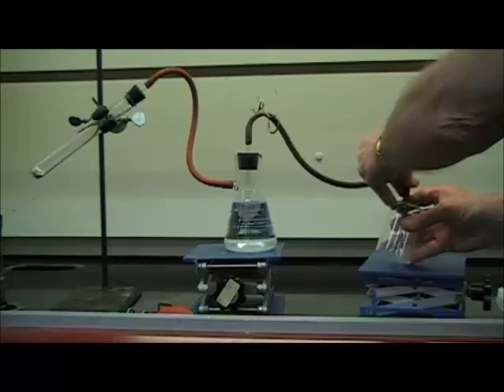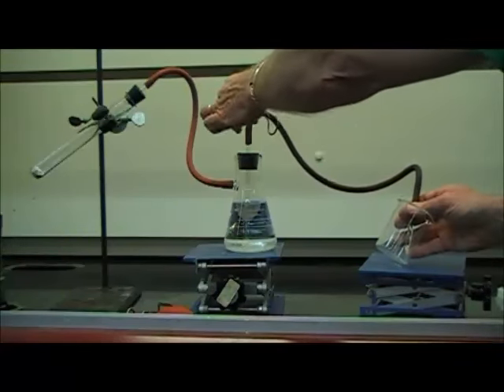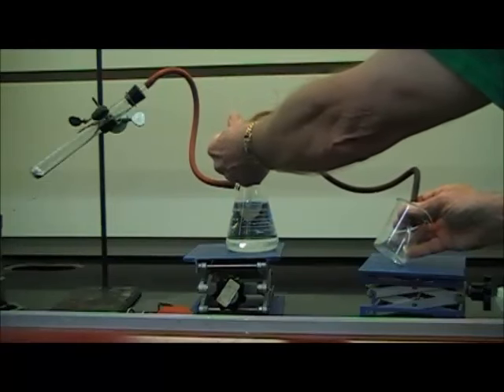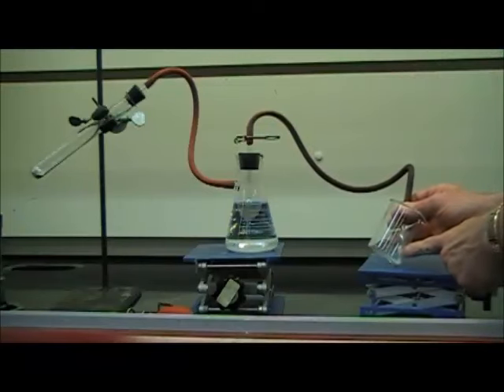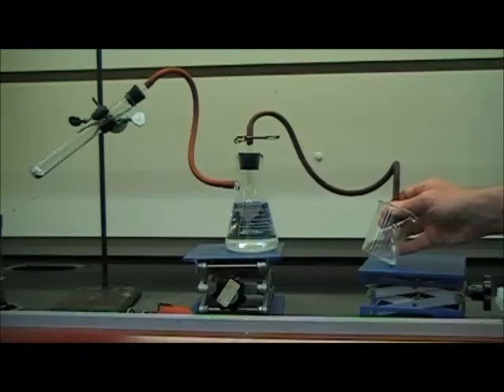I'm going to hold the pipette down in the corner of that beaker down there, and I'm going to unclamp the pinch clamp. In so doing, I don't know if you can notice, but a small amount of water has come over into the beaker. Not a lot, and if it keeps on coming at that point, then you know that you have a leak somewhere. But I think at this point we're fine.